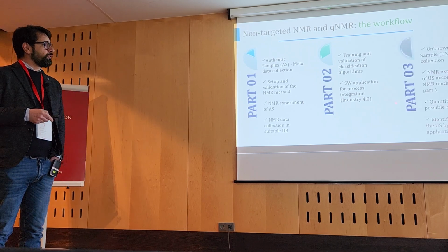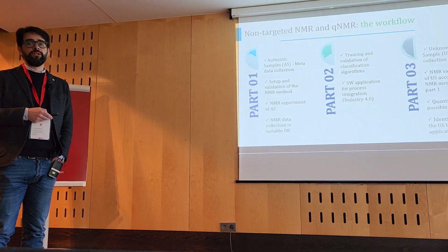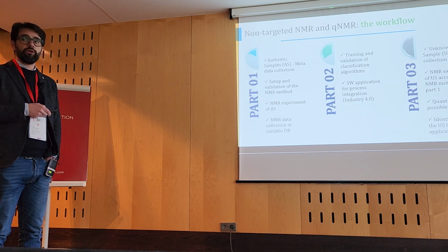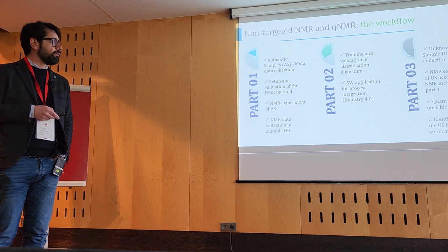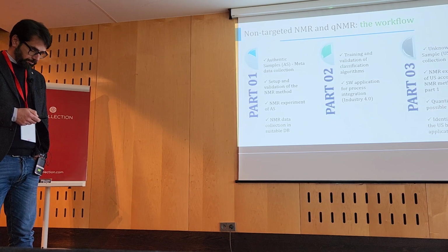And then we can move to the final part, the routine part, where unknown samples are submitted to the analysis following the same protocol that we adapted in part 1, and then we get the information on quantification and identification.